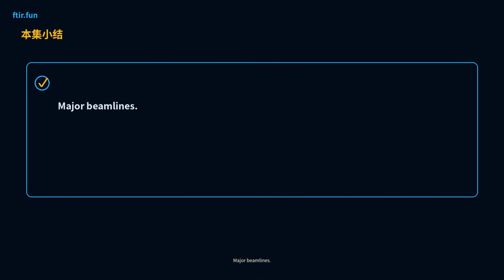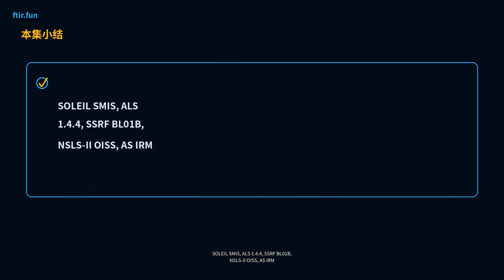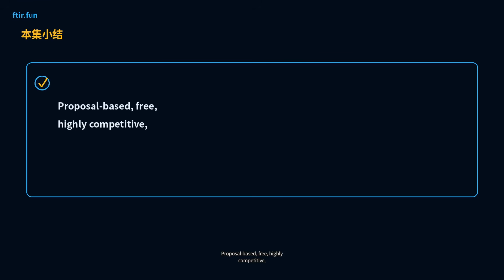Major beamlines: SOLEIL SMIS, ALS 1.4.4, SSRF BL01B, NSLS-II. Beam time application: proposal-based, free, highly competitive. You must clarify why synchrotron is necessary.